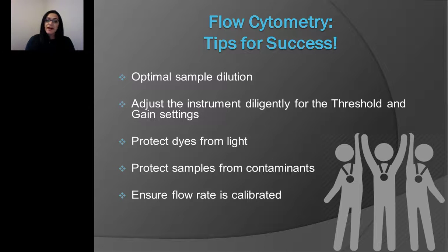Then also we have to ensure the flow rate is calibrated. For this instrument, we did a calibration for the tube and also a calibration for the plate loader, just to make sure that we were having accurate results and we were not missing any settings when we first purchased this instrument.